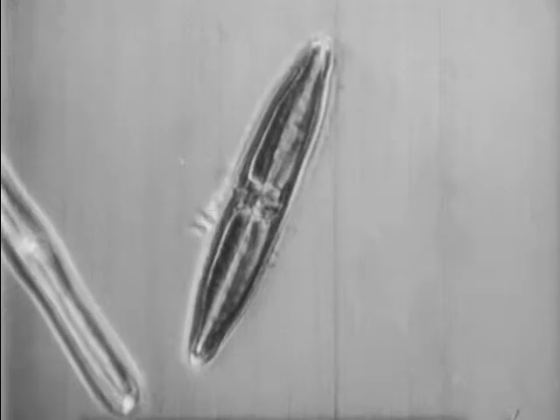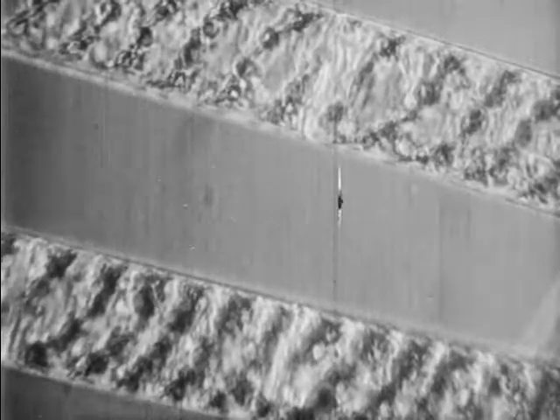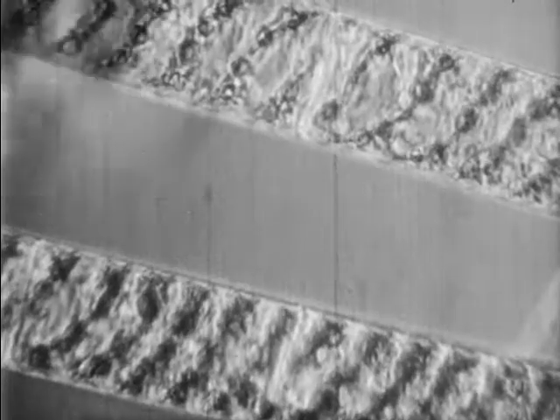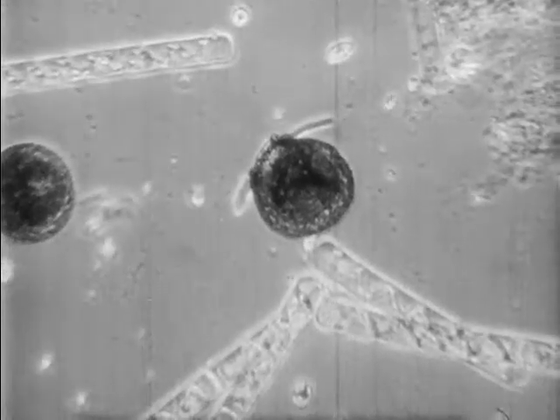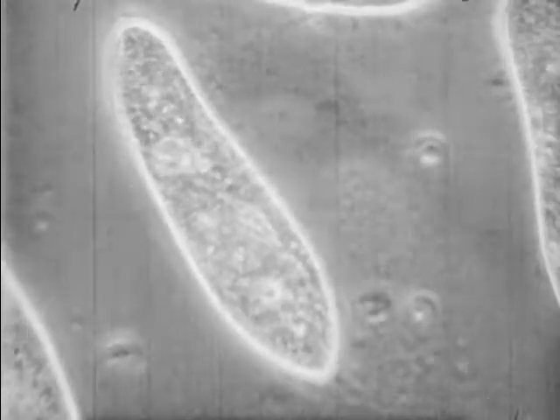Some plants reproduce by division too. But look at these. You can see that the cells have not separated. Each one of these things from our bottle takes in nourishment, grows, and reproduces. We can see that they are alive.